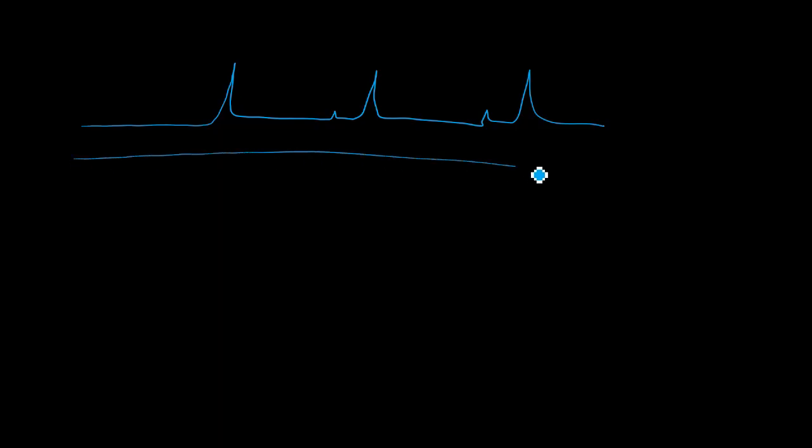Now as our final step, let's talk about the data interpretation, right? Normally just like in XPS, you will have a same kind of graph here like this. There are some peaks, but the only difference is instead of binding energy you will see the kinetic energy, or otherwise let's say electron energy.